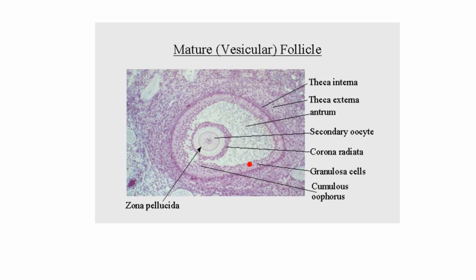They're making estradiol 17 beta and inhibin, by the way. And of course, you can go look that stuff up at the endocrine section. And the other thing I want to say on these ovaries is inside a follicle, no matter how big it gets, and I'll show you, there's never any blood vessels, lymph vessels, nerves, or anything. There's nothing in a follicle besides just the follicular structure.